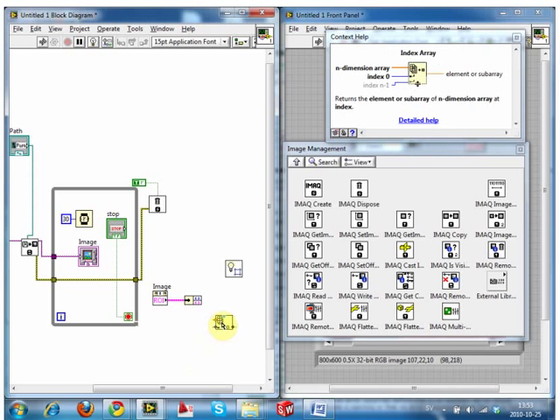Yeah? You got one of those on your screen? You're clicking like a million clicks here. Yeah.